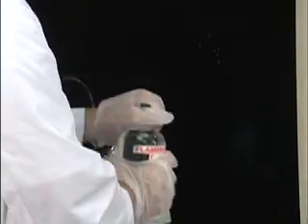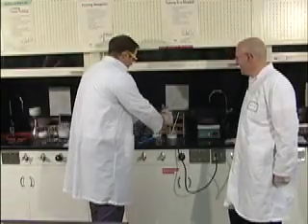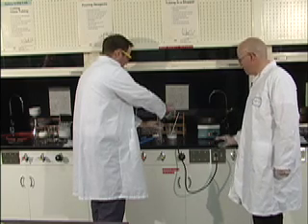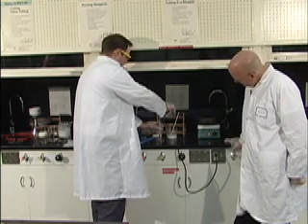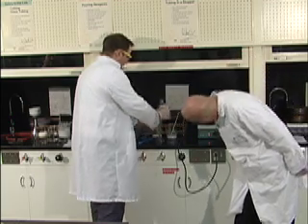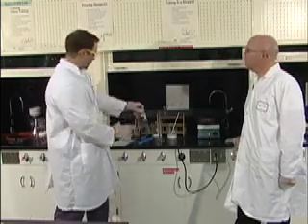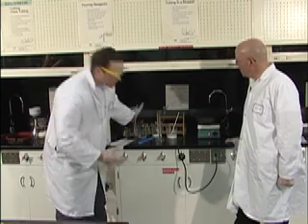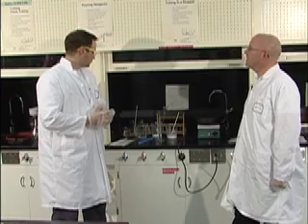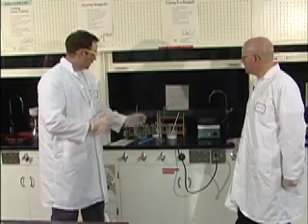It's also very flammable, so you want to keep it away from the hot plate too. So when you pour in your ethanol, again, we want exactly 80 mils. That means the meniscus is going to rest exactly on the 80 mil mark. You're a little high, but that's okay. But you wouldn't pour that back into the ethanol beaker. You pour that into the sink. Yes, if you're a little high, definitely. All right.